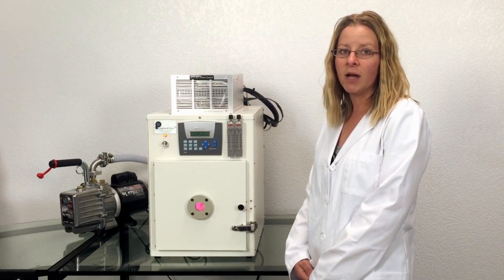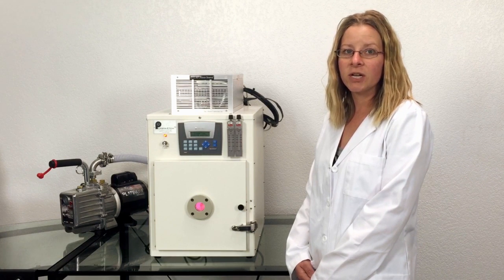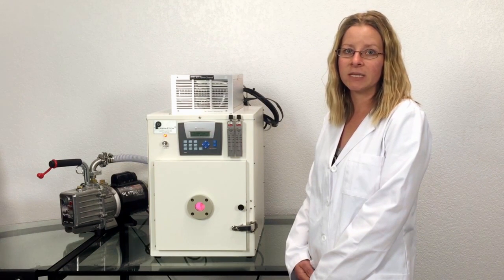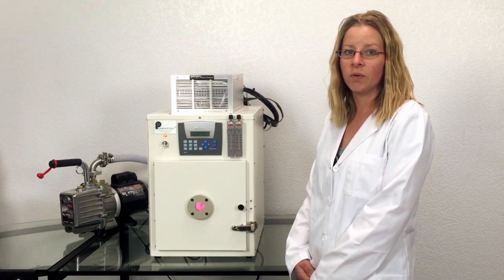You can see the pink glow of the plasma inside the window. For our demonstration, we are running a very short plasma cycle. When we end the cycle, the machine will turn off and the door will open.